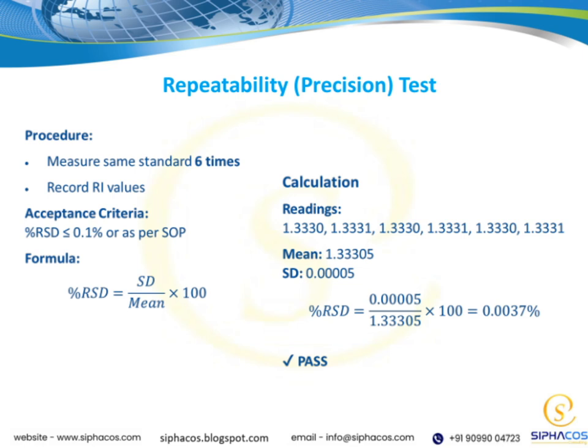If we notice significant variations, it indicates that there might be some inconsistencies or uncontrolled variables affecting our results. Connecting this to the bigger picture, conducting repeatability tests helps us identify potential issues early on and improve our measurement procedures. Ultimately, this strengthens the reliability of our entire testing process and supports better decision-making moving forward.